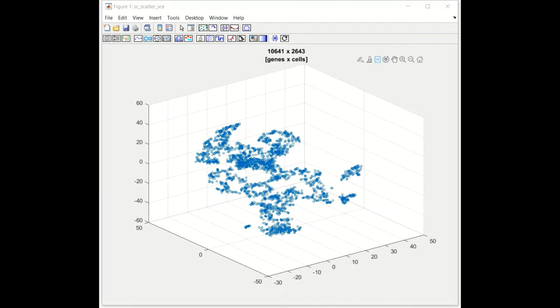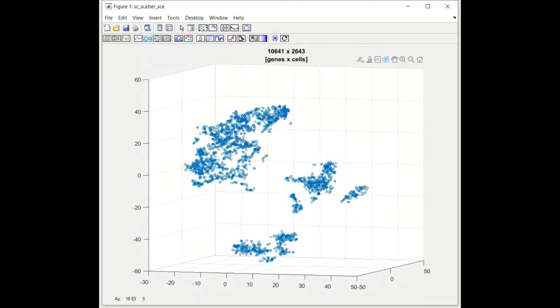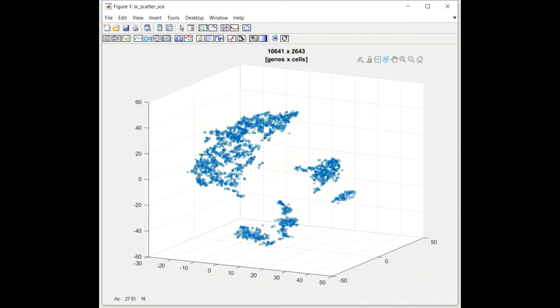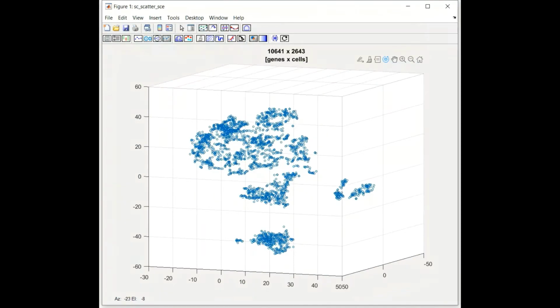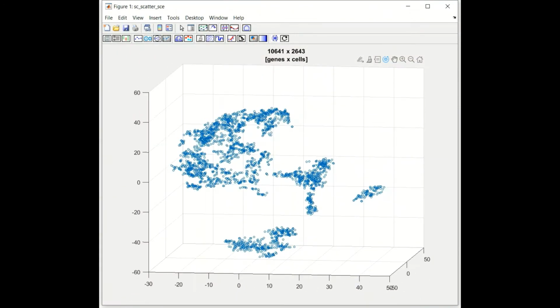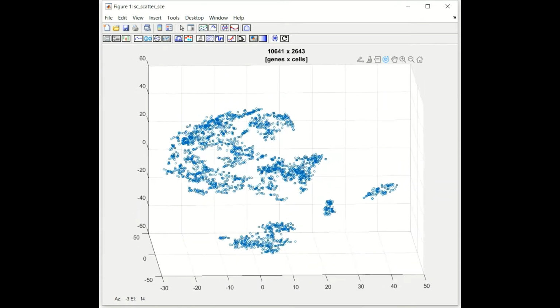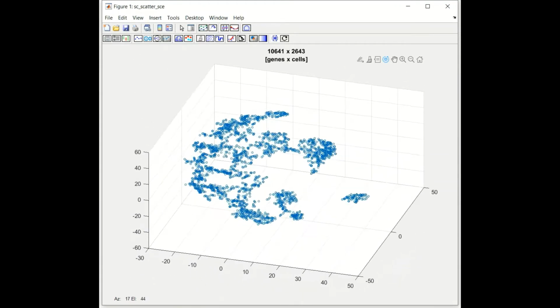Okay, I'm going to show you how to use single cell cluster and the interface to cluster cells into groups. So here I load this cell population which has not been classified into groups. So you can see these cells in different groups. So we have a quick estimation how many clusters we may come up with.